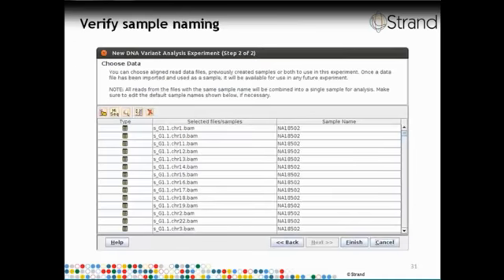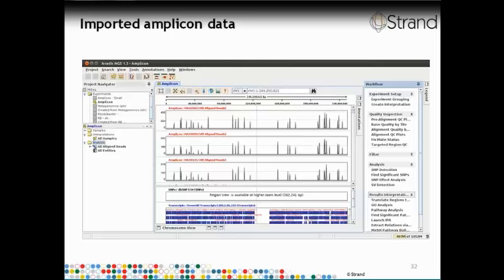So for each of the 96 samples, we have the percentage of supporting reads, the percentage of variant reads, the coverage at that particular location, and the strand bias at that location in a particular sample. And if you have 96 such samples, you'll have 96 times 6 columns out here. And the sample count column indicates in how many of the samples that particular variant has been called by the SNP detection software. So you can see that there are some variants which are only specific to a single sample. There are variants which are present in all the 96 samples, etc.